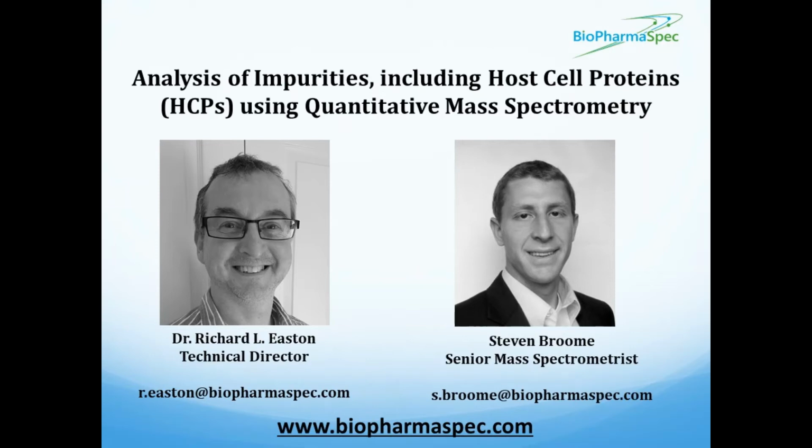Yeah, sure. And as you say, there are a wide variety of impurities that need to be checked for, and we test for a lot of them here at BioPharmaSpec. Just a couple examples of some that we're working on right now: inducer IPTG, for example, Kanamycin, which is an antibiotic, and host cell proteins. We actually have a few host cell protein studies at the US lab site in process right now.